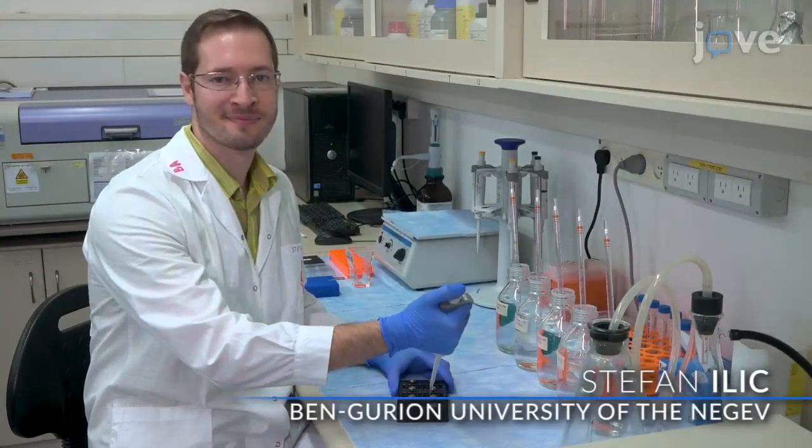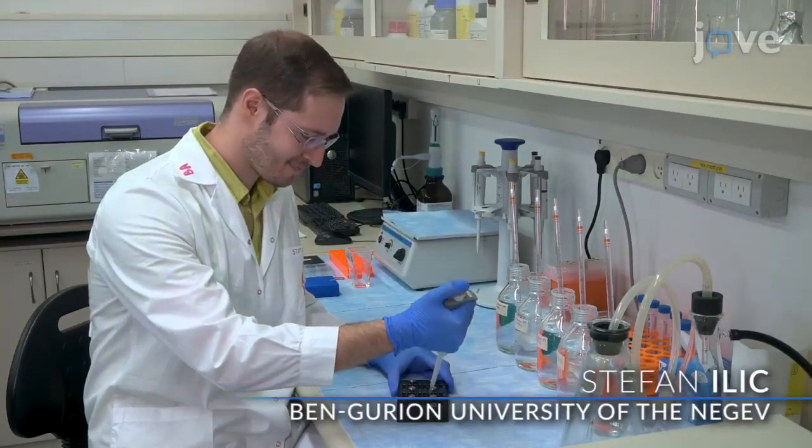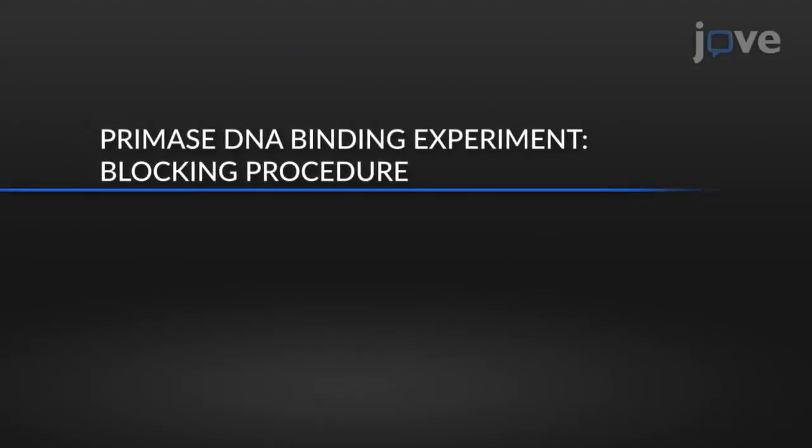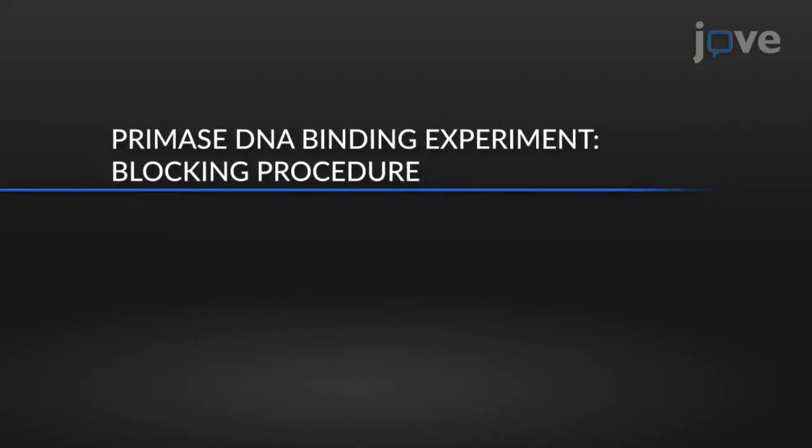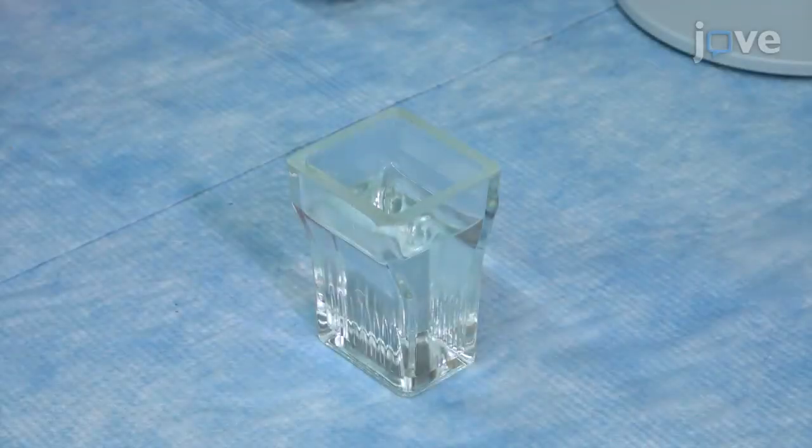Demonstrating the procedure will be Stefan Illich. To begin this procedure, pre-wet the microarray slide.